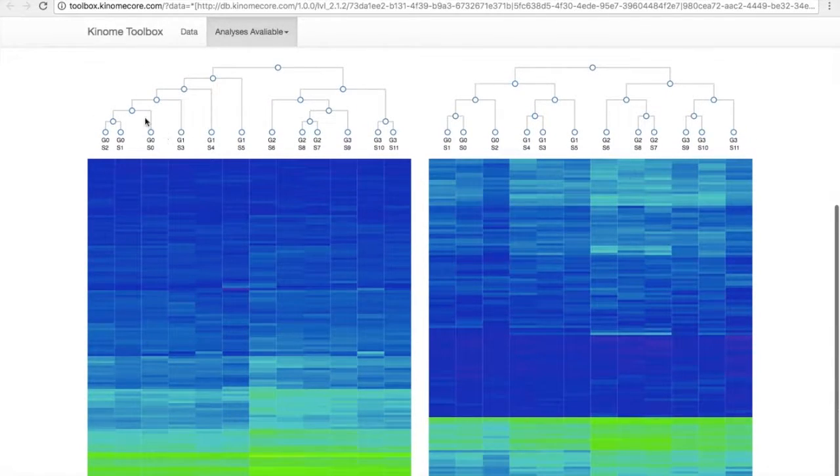On the left, we can see the clustering works reasonably well with the zeros with zeros, the ones with ones, the twos with twos, and for the most part, the threes with threes. What's interesting to note is that the zeros here cluster perfectly, the ones here cluster perfectly, the twos here cluster perfectly, and the threes here cluster perfectly, which suggests for at least this data set, the background correction has actually allowed these very similar samples to cluster together more robustly. Now this is an N of 1, so obviously we need more data and repetition to prove this. However, it is an interesting finding.